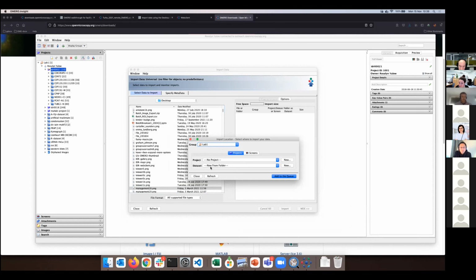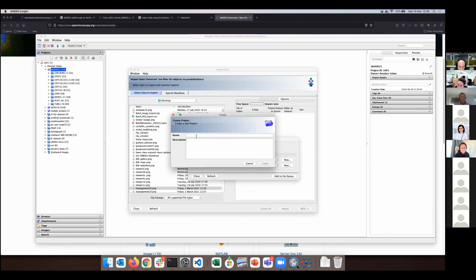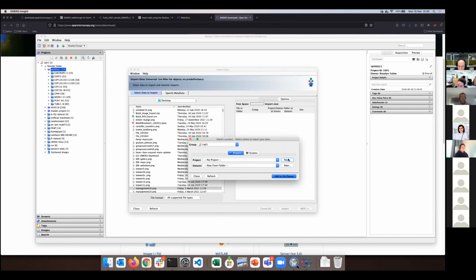And then there are two levels of hierarchy in Omero, two levels of containers: project and dataset. Now I can create a new project and dataset. If I work with high content screening data, I would probably go here and create a new screen, but for the mainstream, this is typically not so. If you are thinking about a vanilla Omero, you can create a new project like so. A new window pops up, and you say new project, whatever. But I will do none of that.